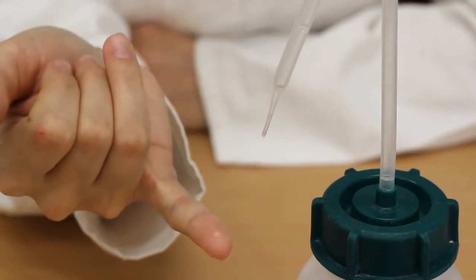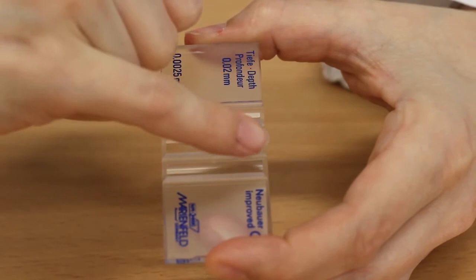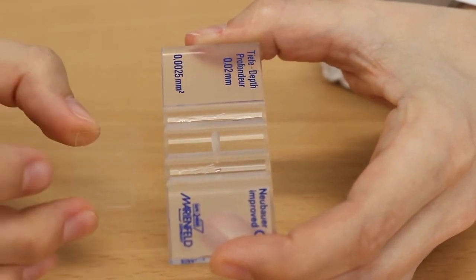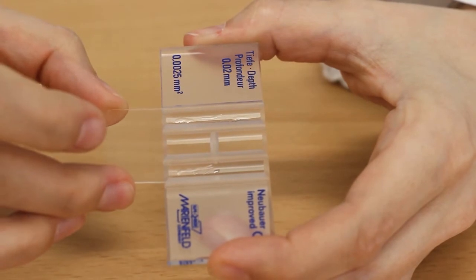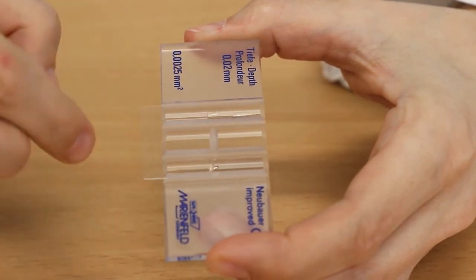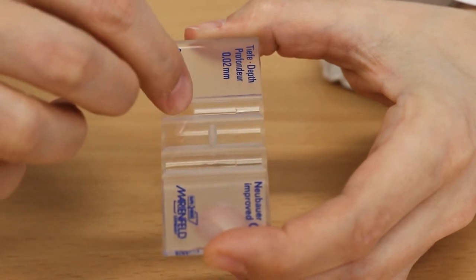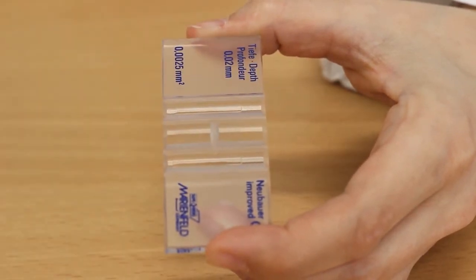To use a hemocytometer, moisten the two support structures with ethanol. Push the coverslip over the two support structures and wait until the ethanol evaporates. Make sure you're using a proper hemocytometer coverslip. Regular microscopy coverslips are not suited and they will bend and distort the volume being analyzed.